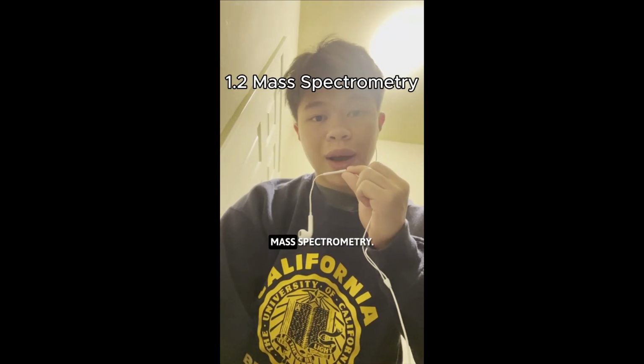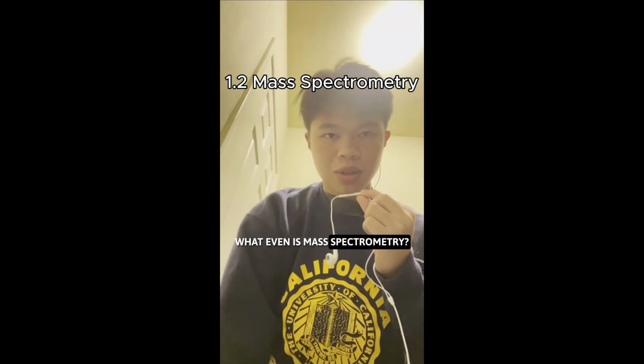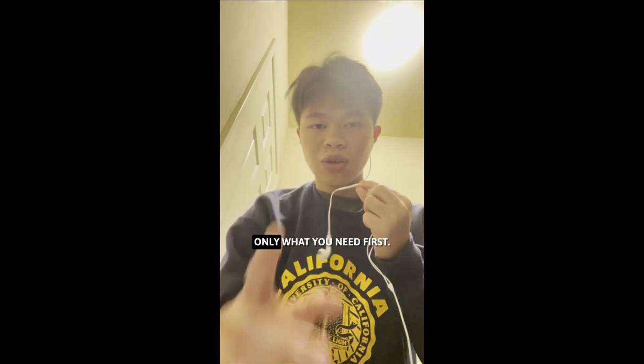I already know your teachers have been teaching you about mass spectrometry. This is day 2 of a minute of chem every day. Today is 1.2, mass spectroscopy/spectrometry. I know what you're thinking. What even is mass spectrometry? Well, it's not too hard. I'll cut all the fluff and teach only what you need.